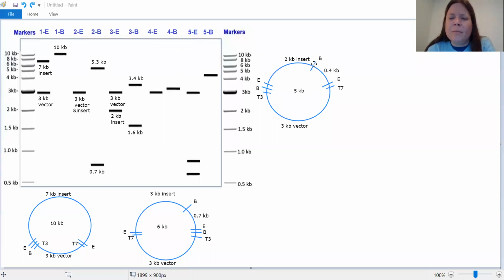Actually, just because I'm finicky, not because you need to be this particular about things, I'm just going to move that site down a little bit to make it slightly more proportionate. But there we go. One more plasmid map down. Now we go on to plasmid 4.